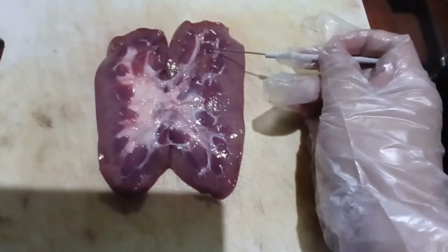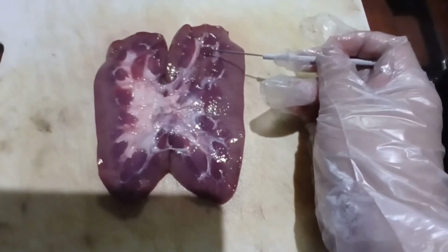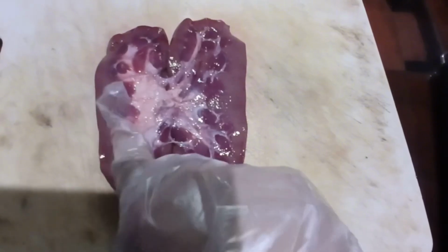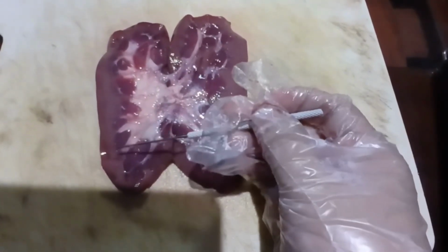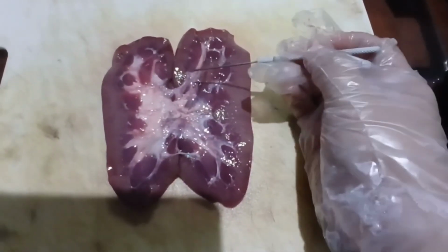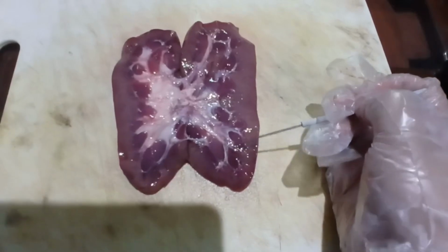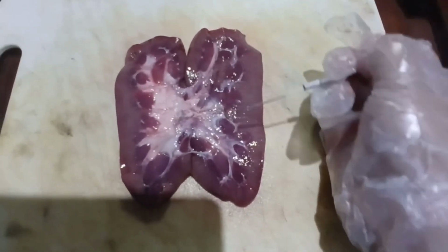As you can tell, these are cone shaped, more of a cone than a triangle, which would be sharper on the edge. The interlobar artery extends into the renal medulla, the inner layer of the kidney. As stated before, this is where they lie.